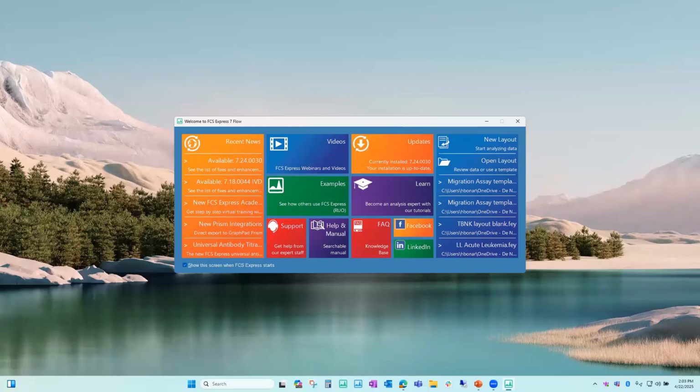This window contains a good amount of information, resources that you can use to help you with the software, but it also gives you access to the workspace. And so to me, this is split up into 3 little sections. The middle section and the left-hand side are more the resources area.